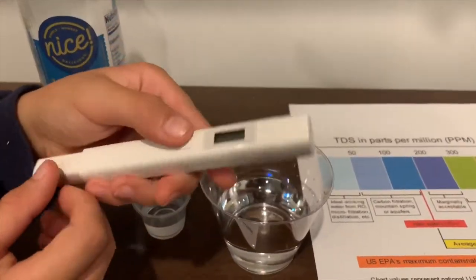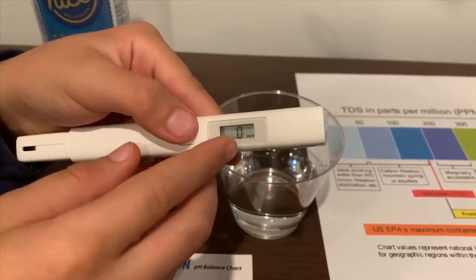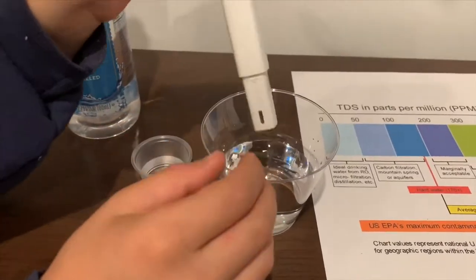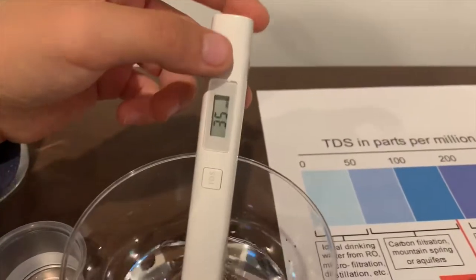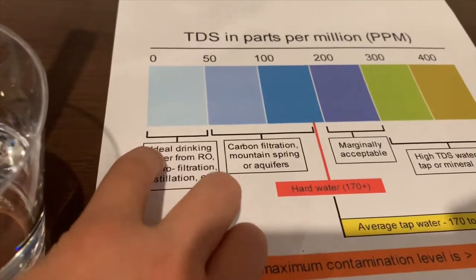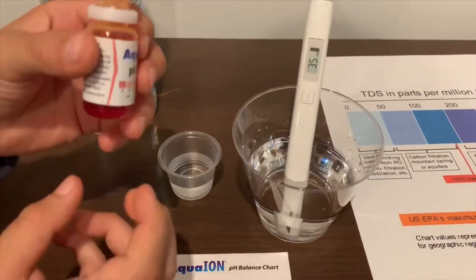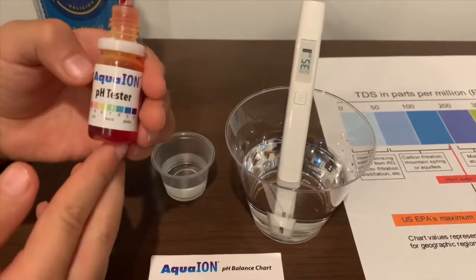Turn on the TDS tester, make sure it says zero, and let's put it in. 35 — that is ideal drinking water. Now let's test the pH level; if you want to buy this pH tester, check the link down below.